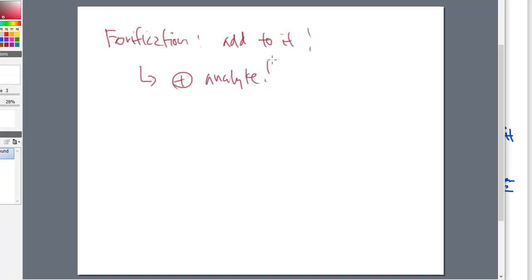So I'm going to go back to our example that we keep using here, and that's iron in a cereal sample. So what this means is that this now gives me a chance to take some solutions and add iron that I know in a certain amount into a sample. That's what we're after here, okay? So this is something that we're trying to measure in the procedure, and again, this is just an example. So what we're trying to find in a cereal sample might be the iron concentration.